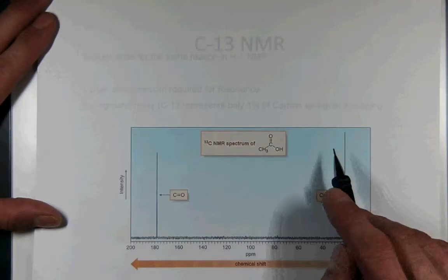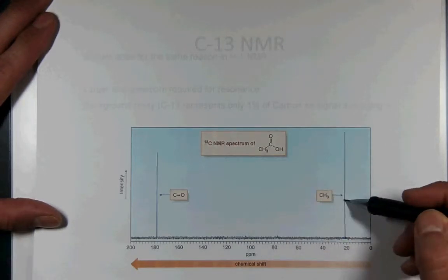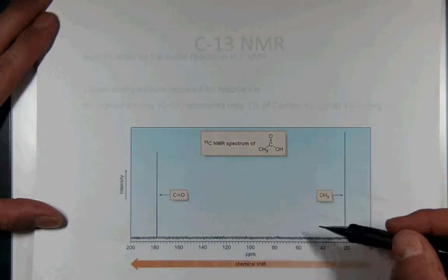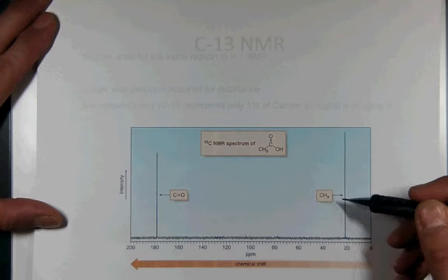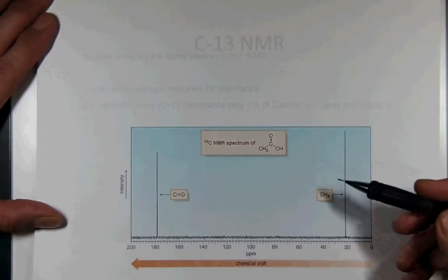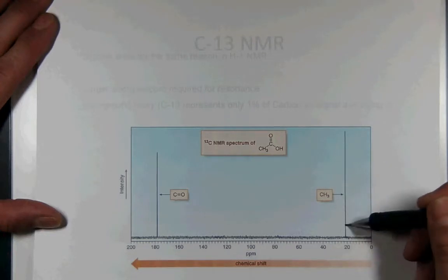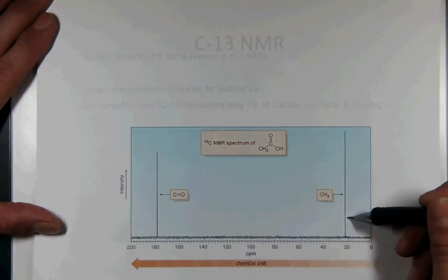So carbon-13 NMR. You get these signals for the exact same reason. The nuclei of the carbon-13 atom are spinning, and you apply an external magnetic field, the B0, and the spinning nuclei can either align with or against the magnetic field. Applying electromagnetic radiation in the radio frequency range flips those nuclei from aligning with the magnetic field in the lower spin state to against the magnetic field in the higher spin state.